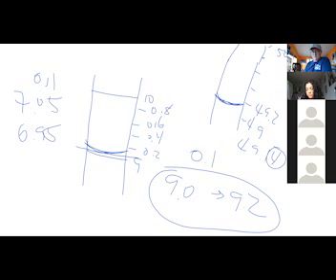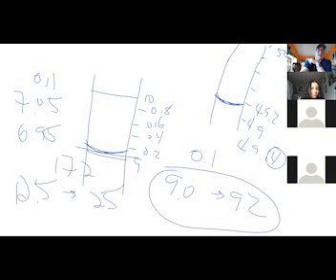Any other questions? So for this one, would you just do the best estimate since there's no tick marks? That one you're on your own. Yeah, basically it's 12. So halfway between 12 and a half and 25 is 17.25, right? That's right in between. So what you're looking for is slightly less than halfway. That's the best I could do for you.